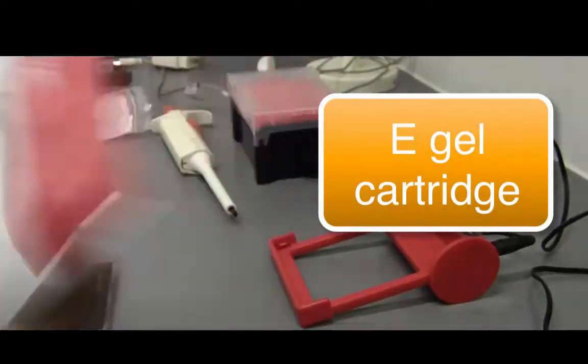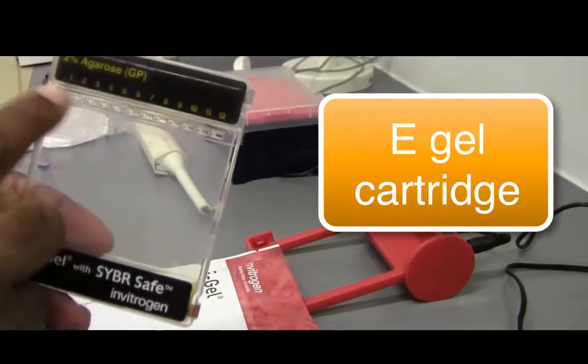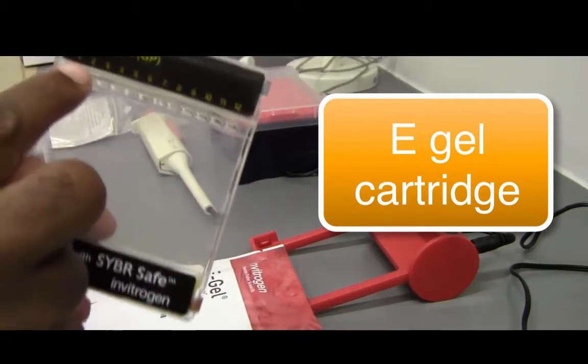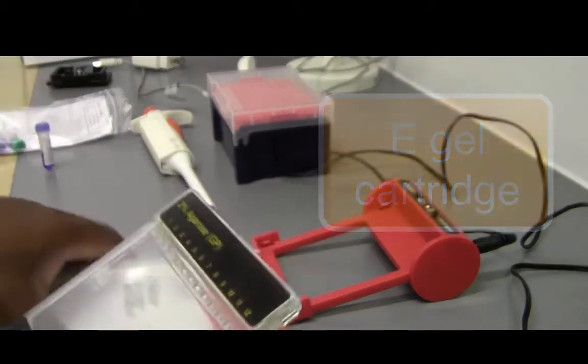You open it up, you'll see this is the gel. You'll see a little cover on top of here. You'll take that cover off and that will expose the wells and this is where you pipette into the wells.